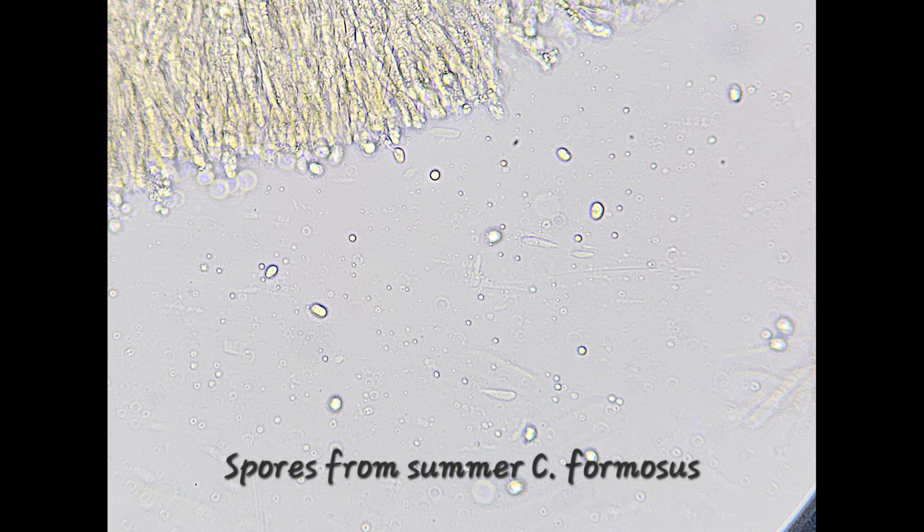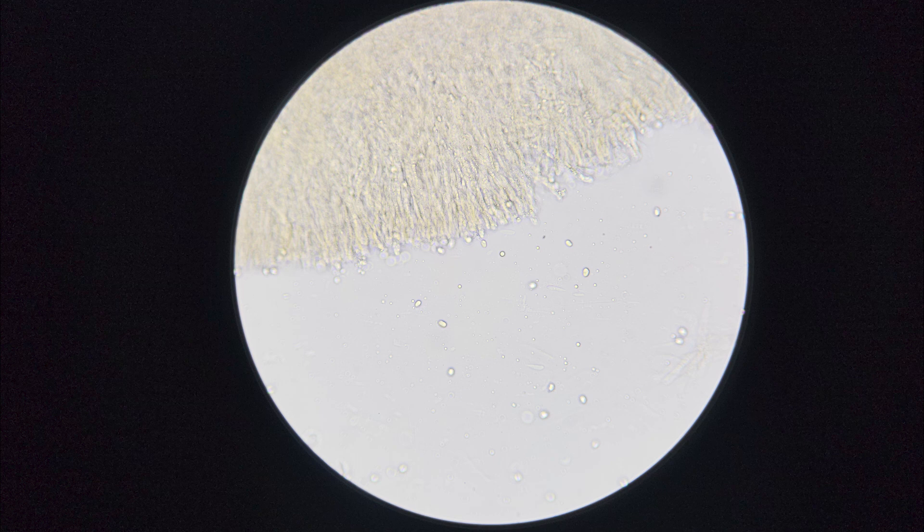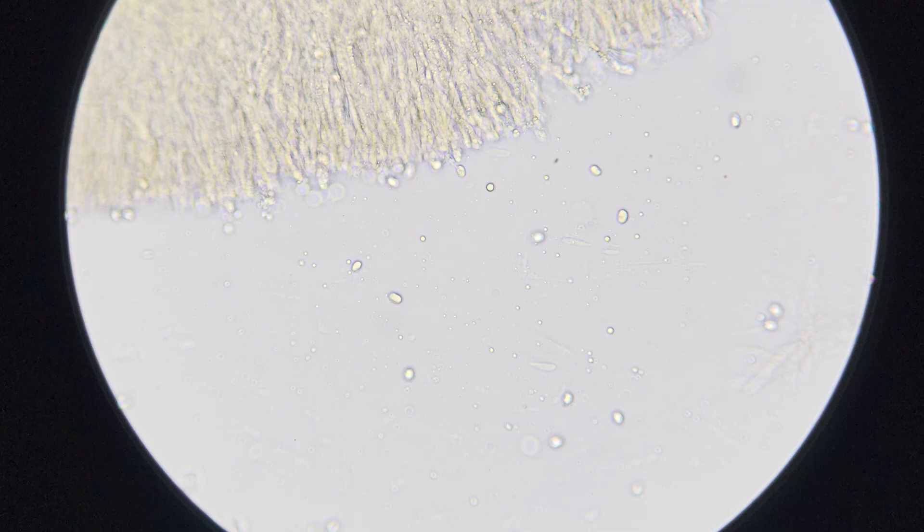Now going to the next picture — more spores. You can see the spores are kind of like bean-shaped. They're ovoid, sort of somewhere between a pumpkin seed and a pinto bean. There's nothing really super significant about them — this particular picture doesn't have a great focus on them — but again, you can just see some spores that are moving away from the fungal tissue.